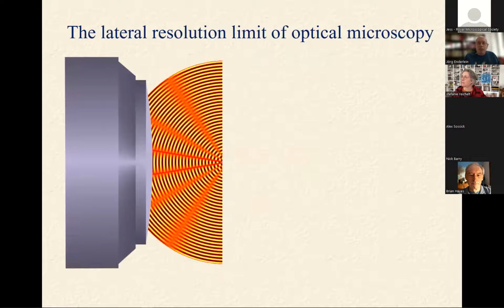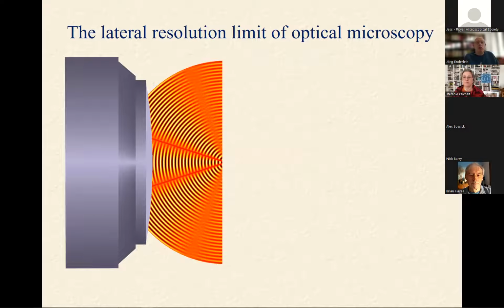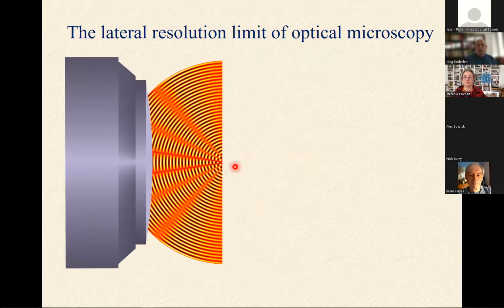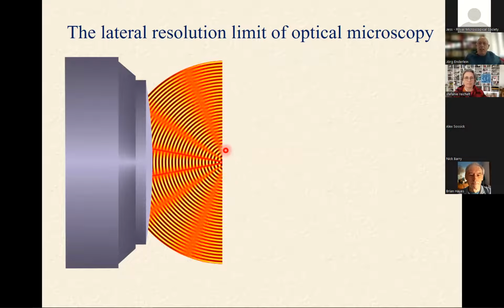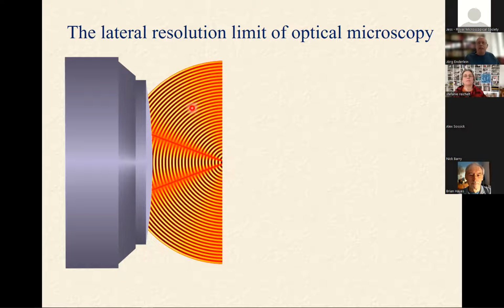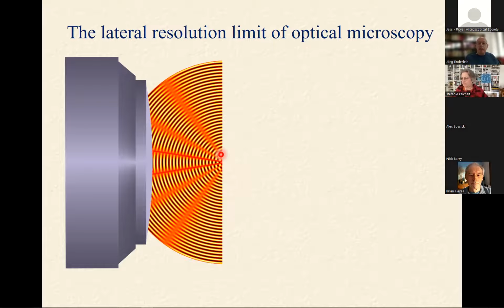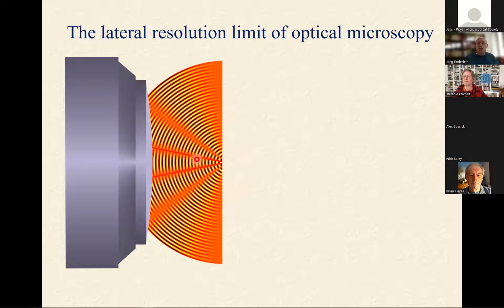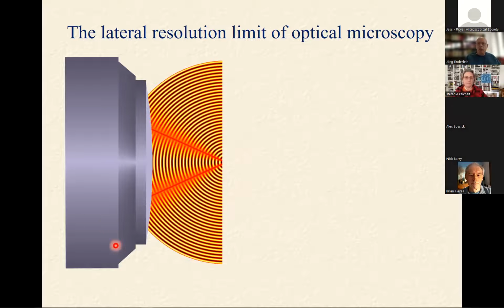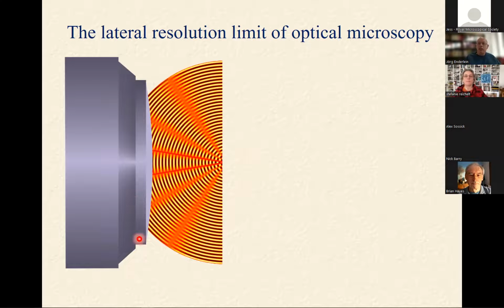As you all know, when you have a wide field microscope, there's a resolution limit, which is simply telling you that you cannot resolve something which is below some critical value. To understand this resolution limit, I always try to present this kind of movie here, where you see the coherent emission of 2 point emitters. There are 2 point emitters here at the very center, and they are emitting light. What you see is the electric field distribution around these 2 point emitters. When they are coherently emitting, they form this kind of interference pattern. These dark lanes are the lanes of destructive interference, where basically no emission takes place. When you now imagine that an objective of your microscope is looking at these 2 emitters, what it sees is simply these electric field wavefronts hitting the front lens of your objective.